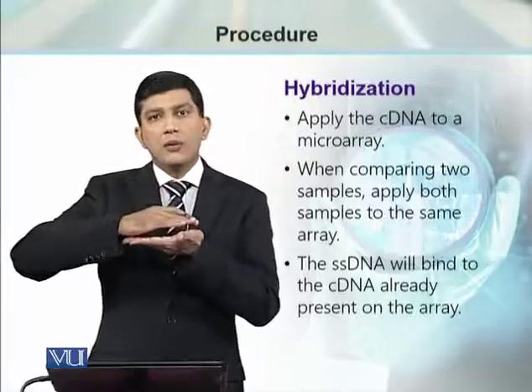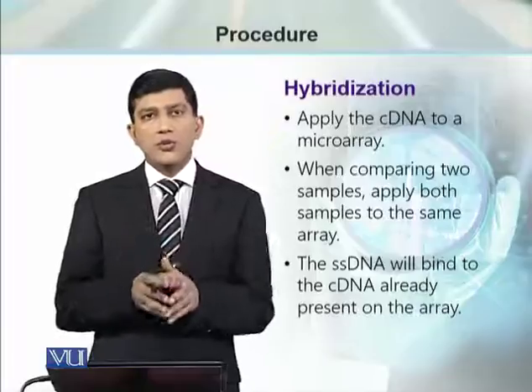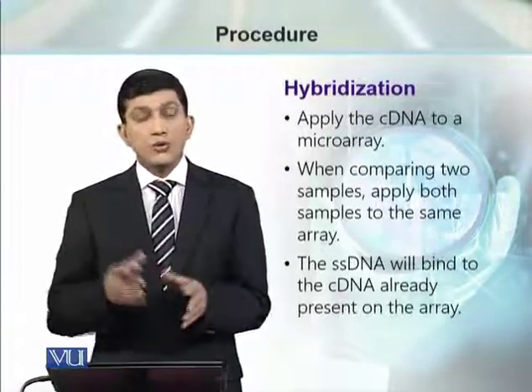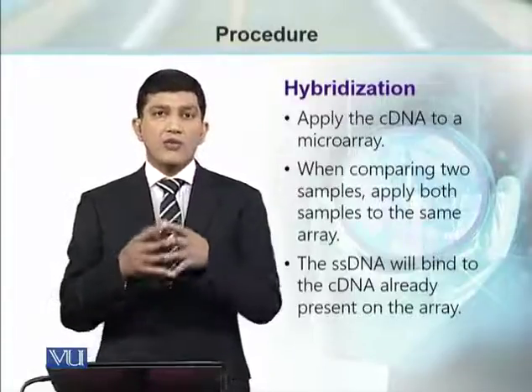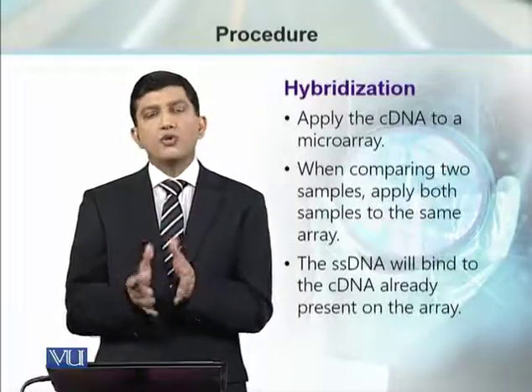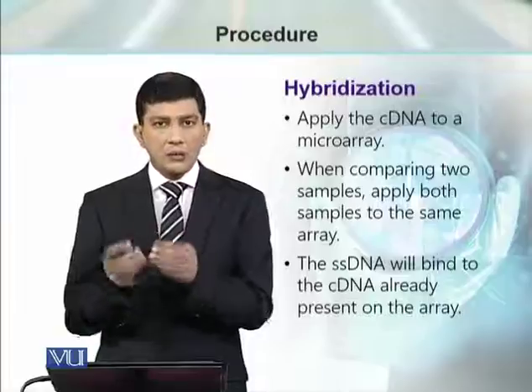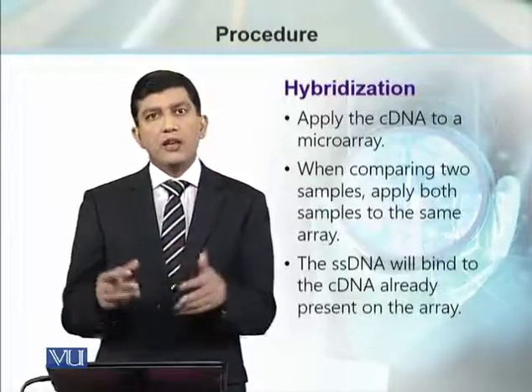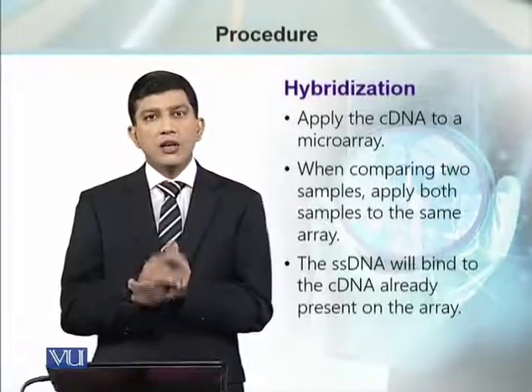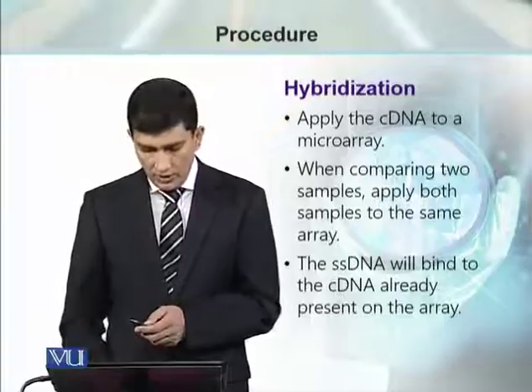अब इसमें हमें एक चीज़ इंश्योर करनी है that the chamber should not be opened, the cDNA should not be exposed to air. उसकी रीज़न क्या है कि हमने जो cDNA यूज़ करना है उसकी वॉल्यूम बहुत कम होगी. अगर हम उसको प्रॉपरली कवर नहीं करते स्पोर्ट स्लाइड के साथ, तो विद इन अ मिनट जो लिक्विड पोर्शन है दैट इज़ गोइंग टू बी in air evaporated because of temperature, and then we will have problem in hybridization.